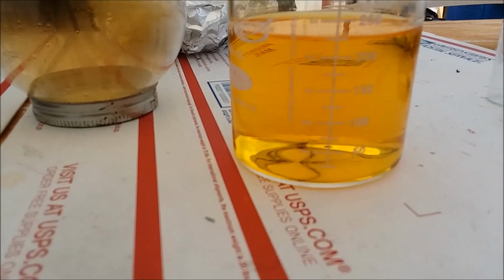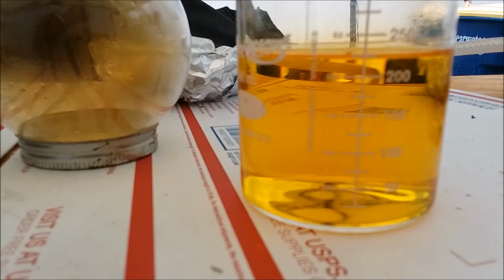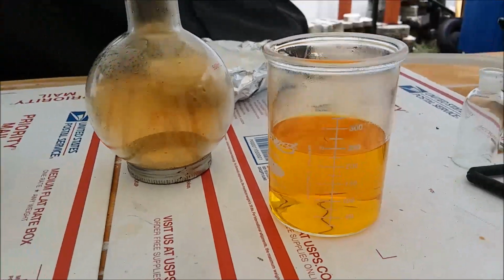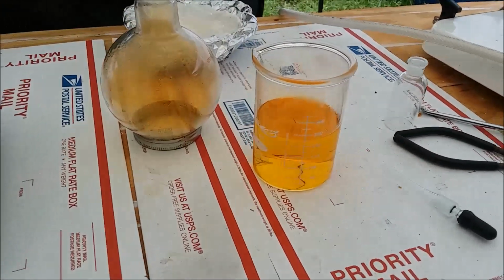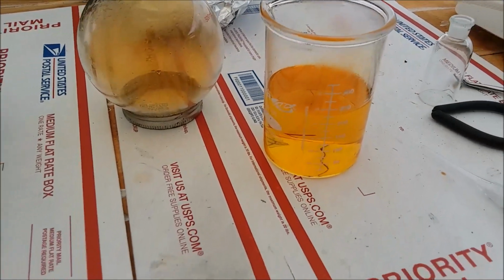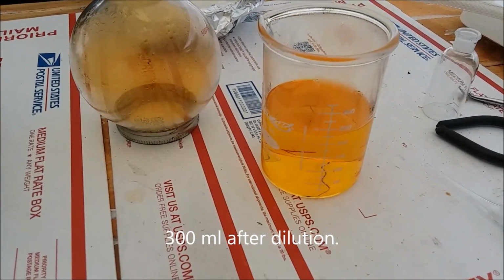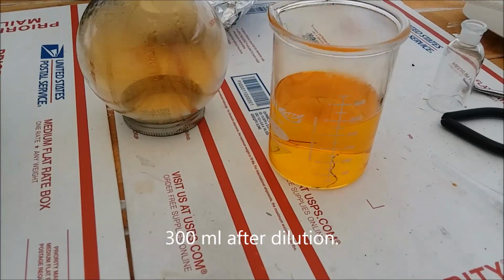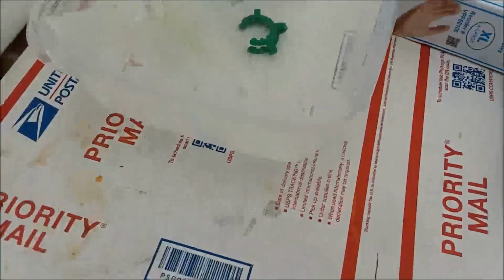Alrighty. So, got what is it? About 225 milliliters. Not quite as much as I was expecting, but hey, it never is, right? Still, that's pretty good. I think it's almost 1/4 of a liter of highly concentrated nitric acid. And I'm going to dilute this down to the 68% azeotrope, so I'm going to have even more. So this worked out pretty darn well. So I got all this nitric acid now.